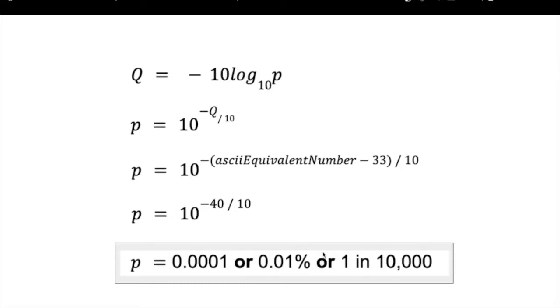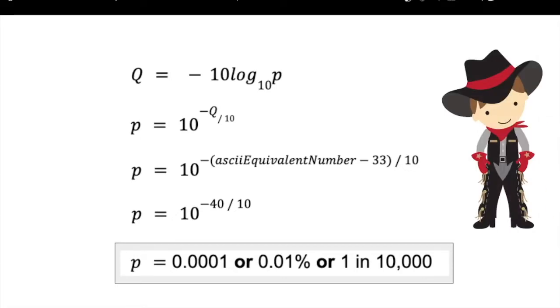Great, so we totally know how to calculate the probability that each base call is incorrect, except maybe not, just a heads up. The formula that I showed you for the calculation is usually the right one. So again, this formula for the quality score is usually right, but not always. Depending on the machine that was used, there can be slight variations of this formula. So it's important to understand the machine the FASTQ file originated from if you want to calculate the quality and/or probability that the base call is incorrect. Remember, this is bioinformatics, a lawless wasteland of the highest caliber.